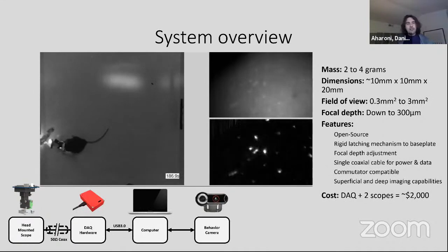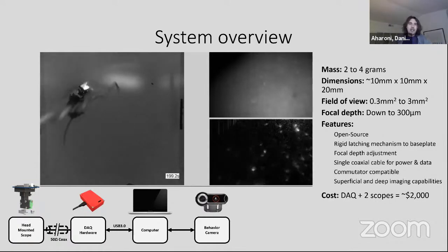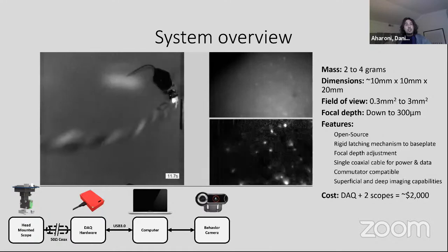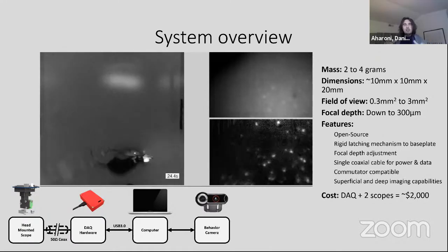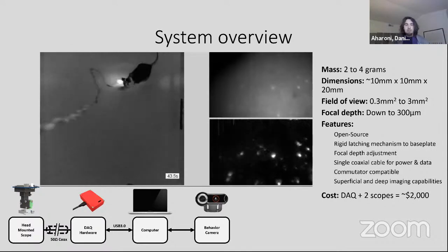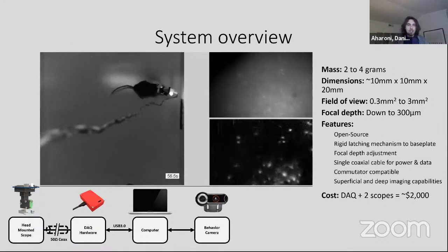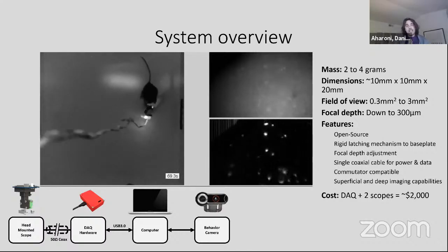We generally do some kind of minimal processing to make it a little bit easier to see by eye. So the bottom right has had motion correction applied to it. Because we're imaging in freely behaving animals and the brain has a consistency of jello, the brain wobbles back and forth roughly on the order of 10 micrometers, so the size of a single cell. And that wobble needs to be corrected before we can do further processing. So using one of many image alignment techniques, we can stabilize the image.